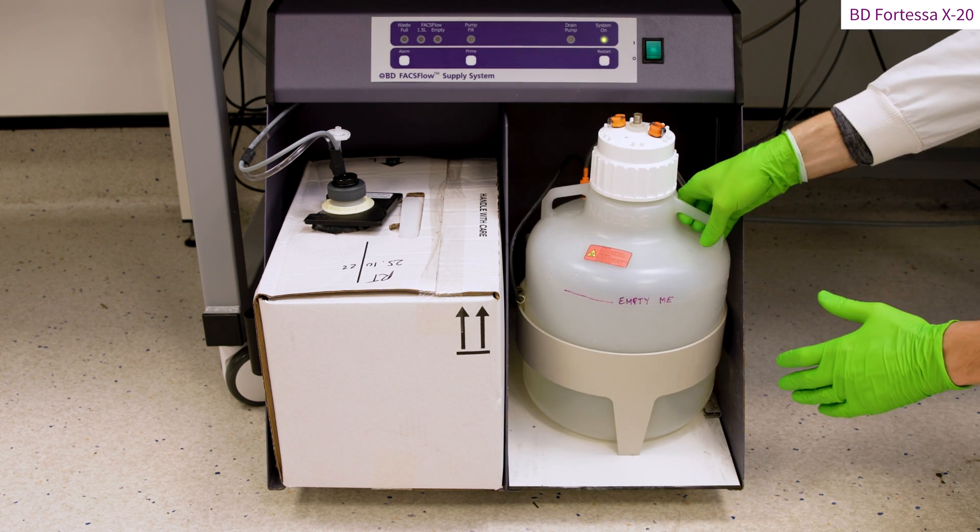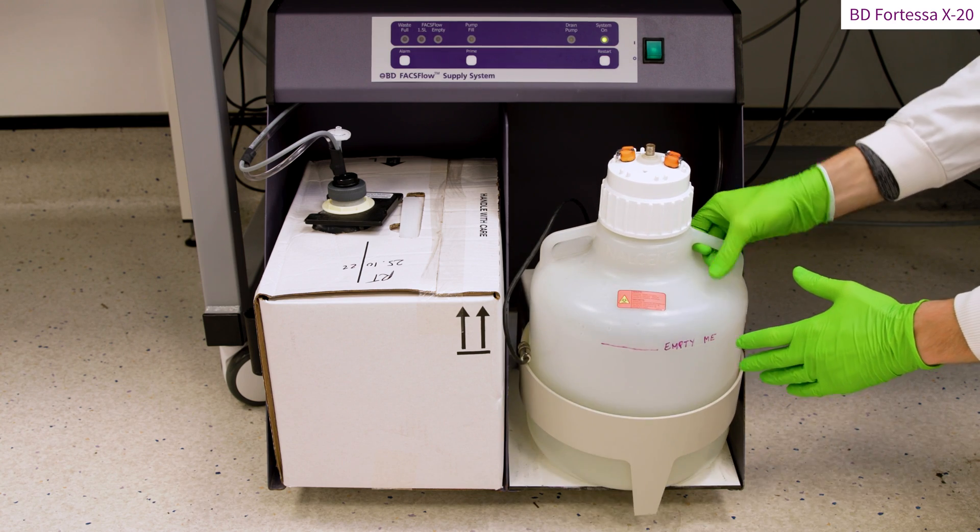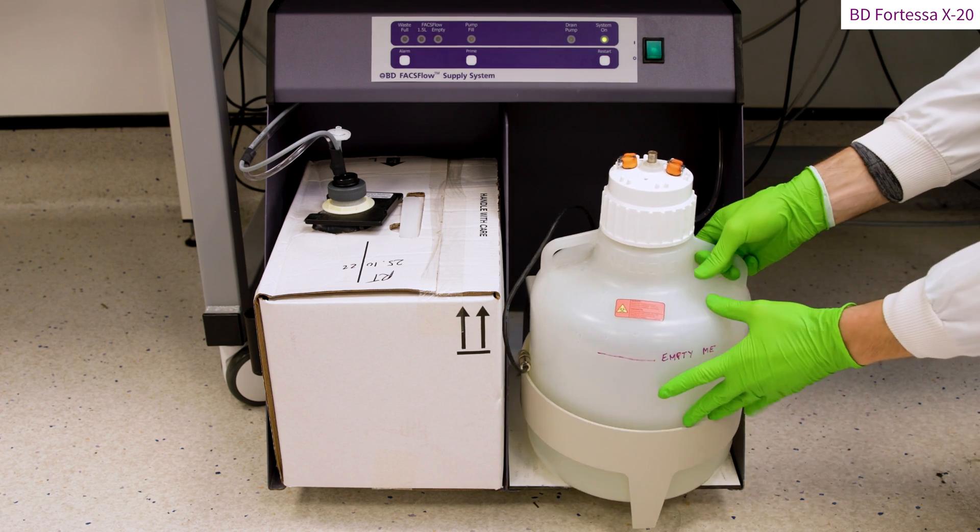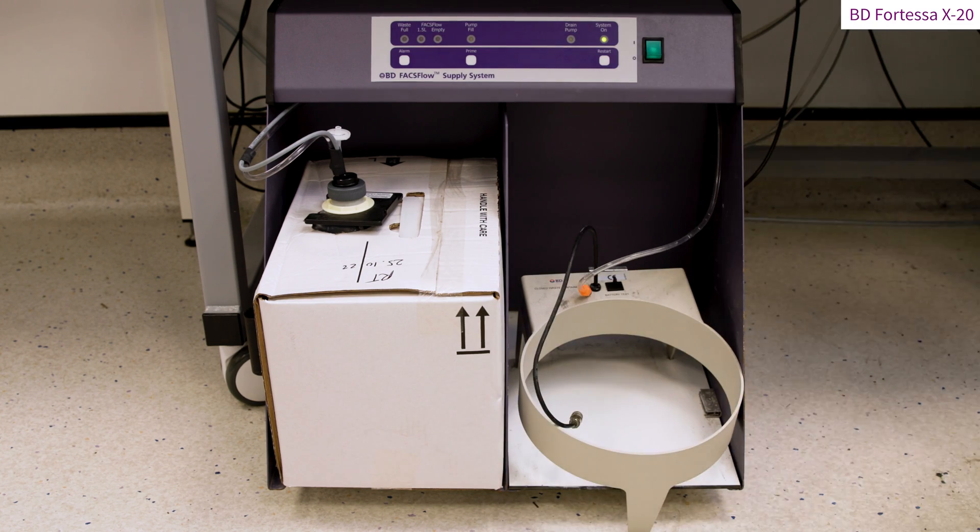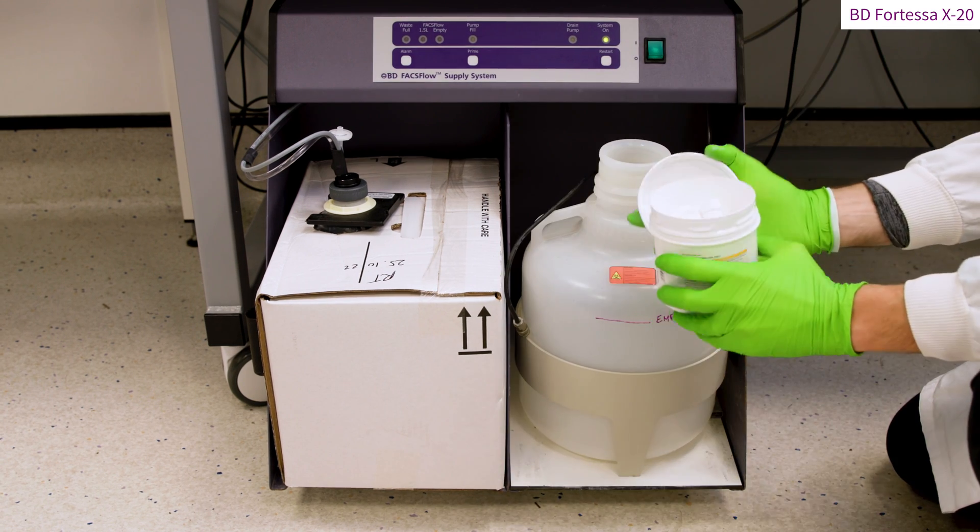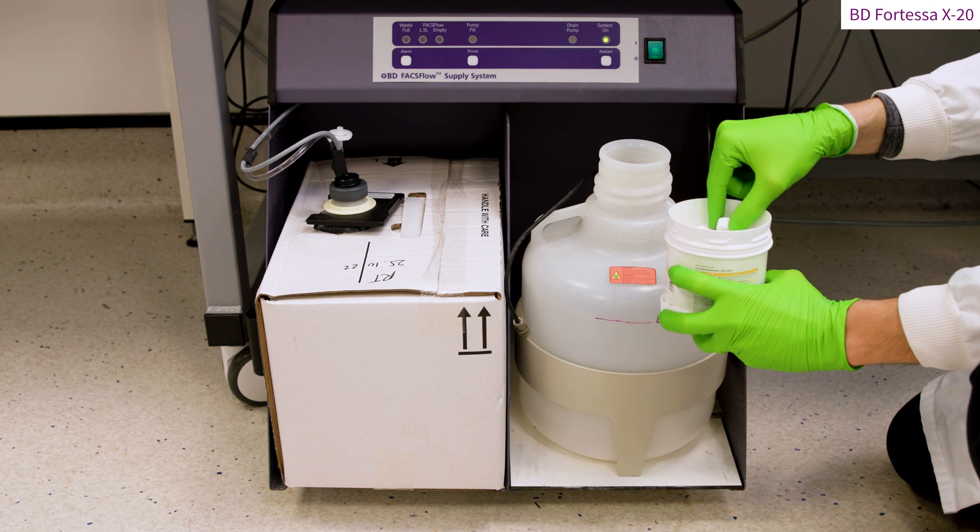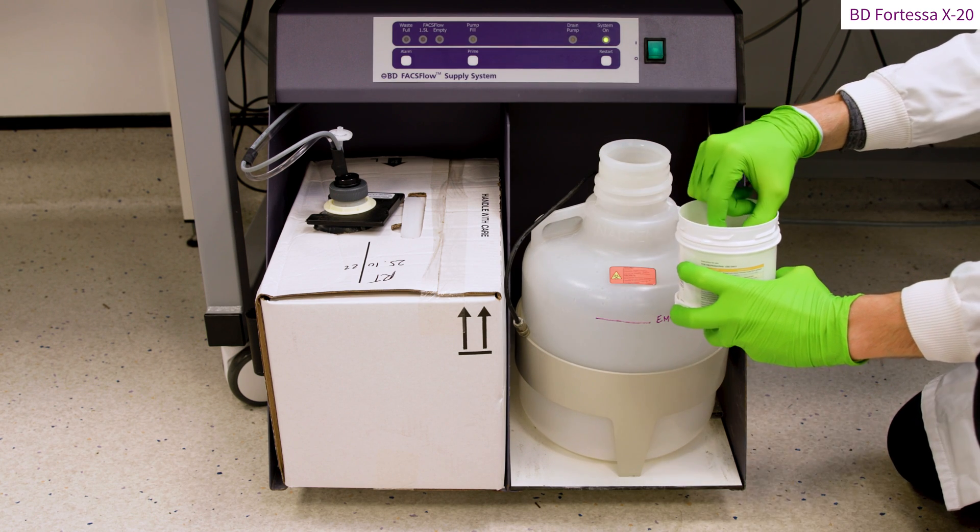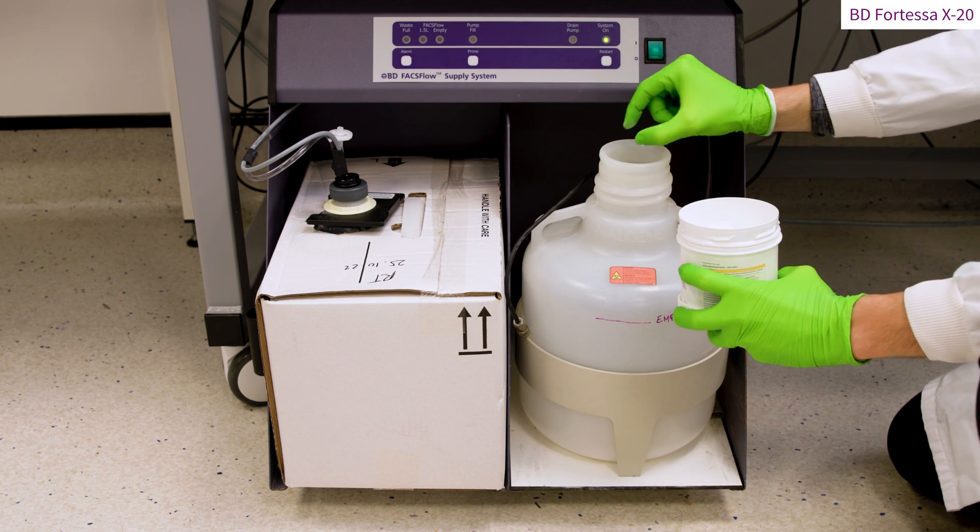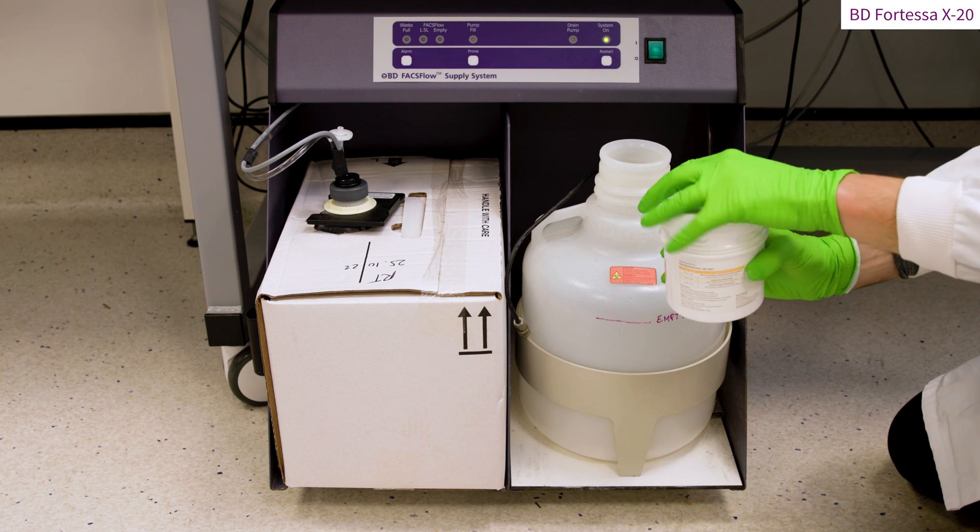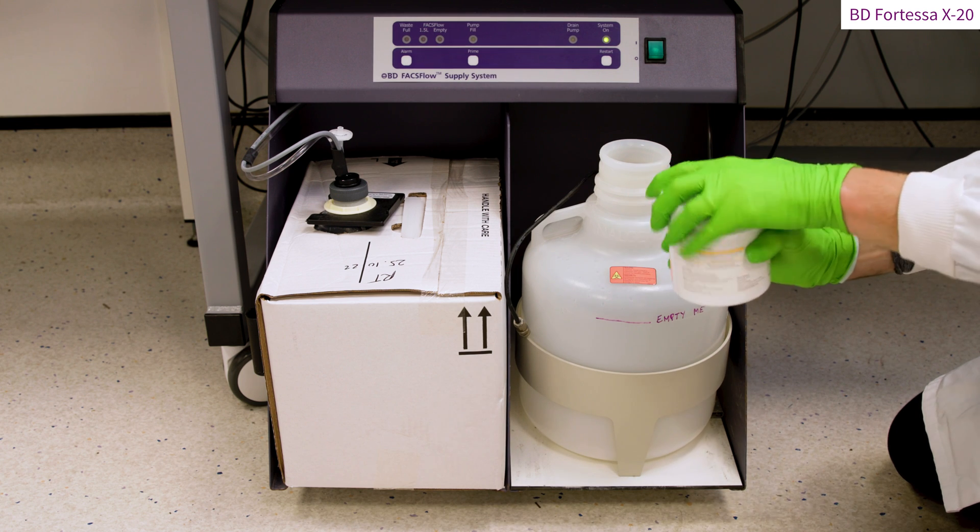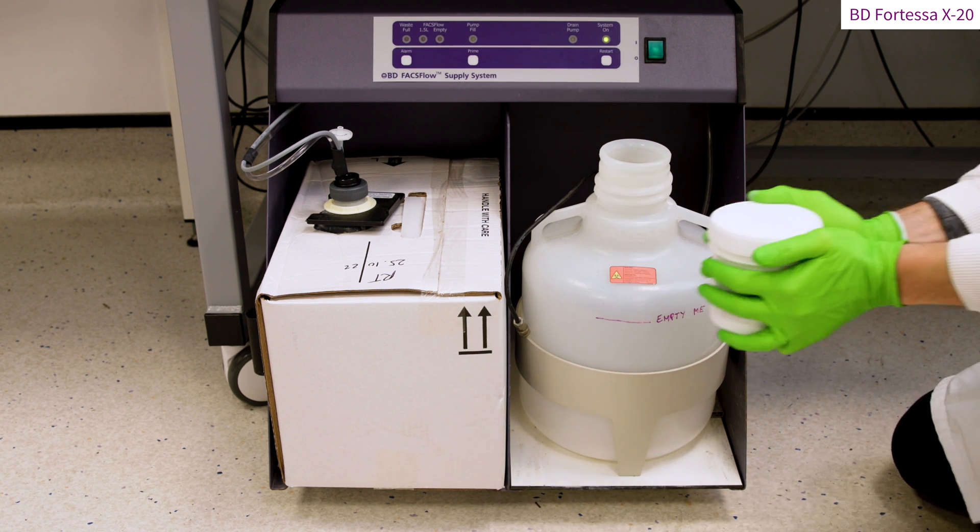Keeping the lid on, the waste tank can now be removed and brought to the nearest biological work dedicated sink. Once the waste tank has been emptied, place it back on the fluidics cart and add two non-effervescent tablets of chlorine or a concentrated medical grade cleaning solution compliant with your risk assessment.